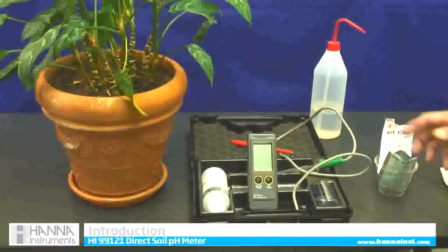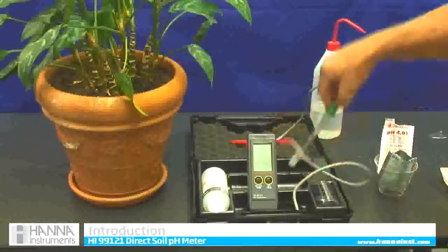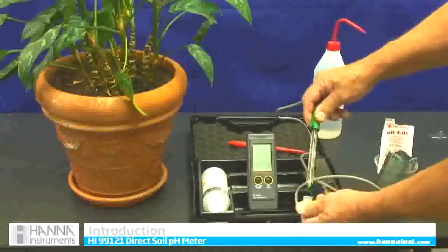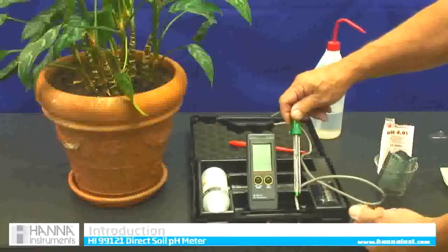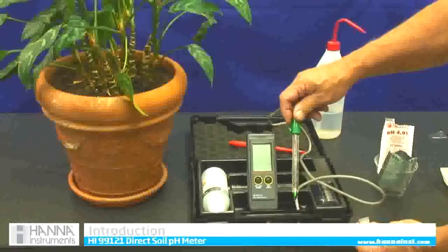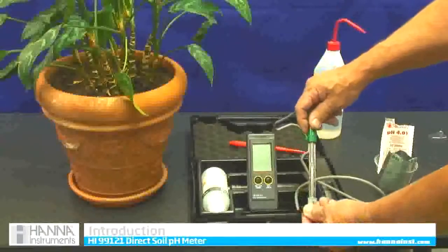It comes in a kit, as we can see here. Here's our meter. It comes with a probe, and the probe is glass — we make it out of glass on purpose so it is extremely accurate and fast responding, but you have to be careful because it is fragile. It has a nice glass probe.